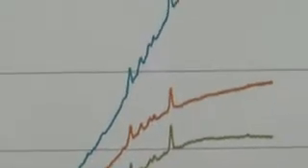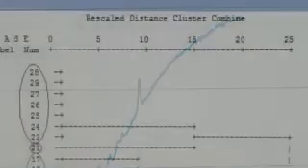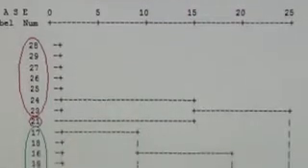I've also been investigating if we can tell different brands with similar spectral patterns apart using statistics. Using a computer software package, it is possible to group brands based on their spectral pattern into groups. Using a computer to do this means that the decision is made objectively, removing any human bias. A chart called a dendrogram can be produced showing how the different brands can be grouped and how similar they are to other groups.